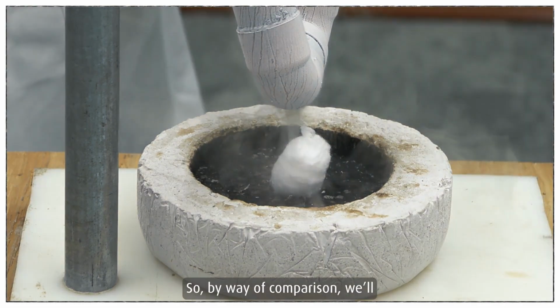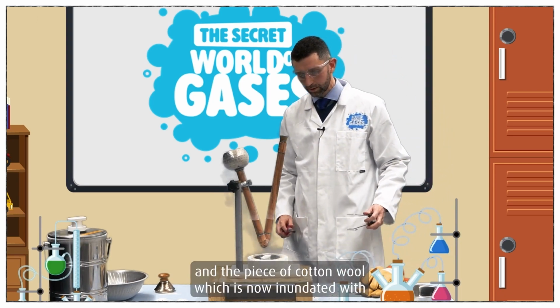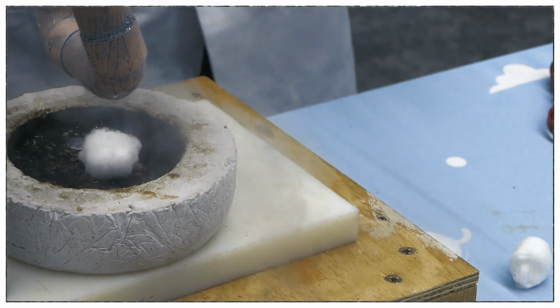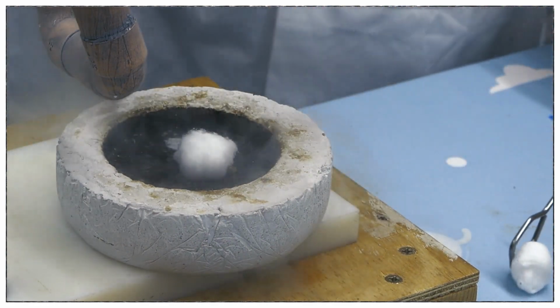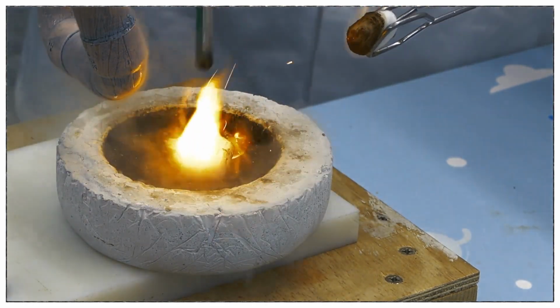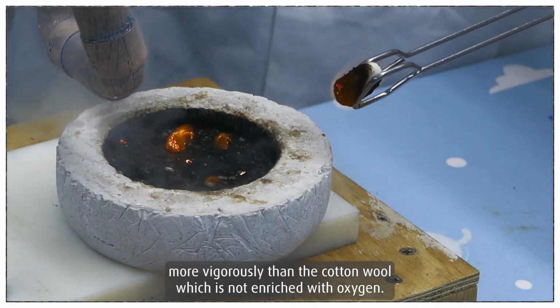So by way of comparison, we'll burn an unchanged piece of cotton wool and the piece of cotton wool which is now inundated with air enriched with oxygen. We can see that the cotton wool enriched with oxygen burns very much more vigorously than the cotton wool that's not enriched with oxygen.